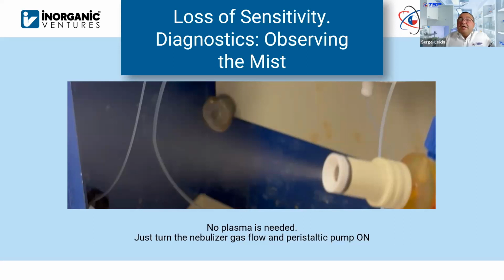The reason behind that was a bit of a mystery that we had to solve on site, where the nebulizer produced the mist, but when inserted into the spray chamber, the signal was lost. So we had to look, and what happened is there is an adapter here. The adapter has a collar at the end. When the nebulizer was pushed all the way into the adapter, it just blocked the sample orifice, and the signal was lost. So that was an interesting mystery that we had to resolve.